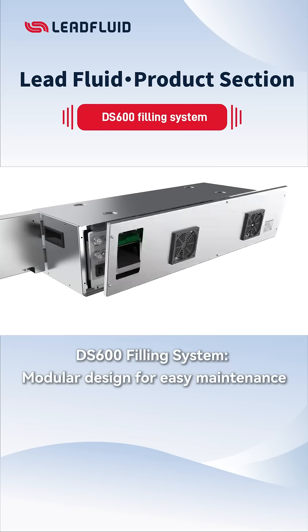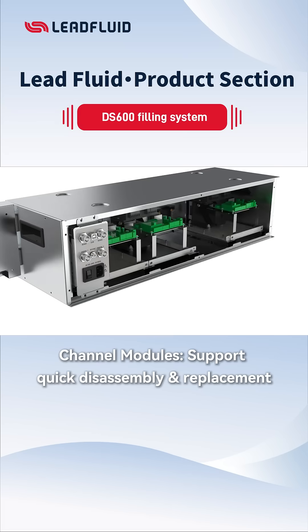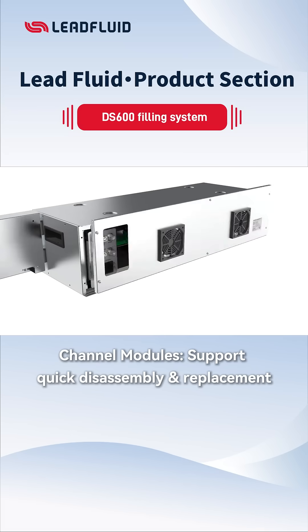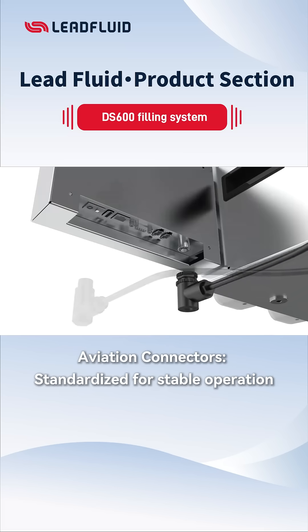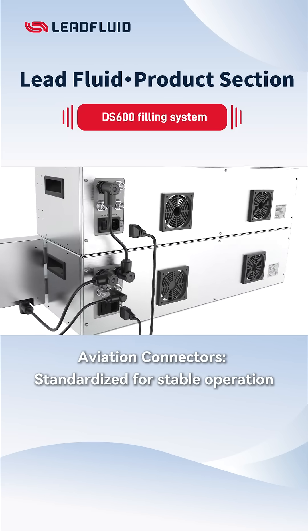DS600 employs modular design for simplified maintenance. Channel modules with tool-free disassembly enable rapid replacement, minimizing downtime. Aviation connectors ensure neat wiring and stable connections for reliable long-term operation.